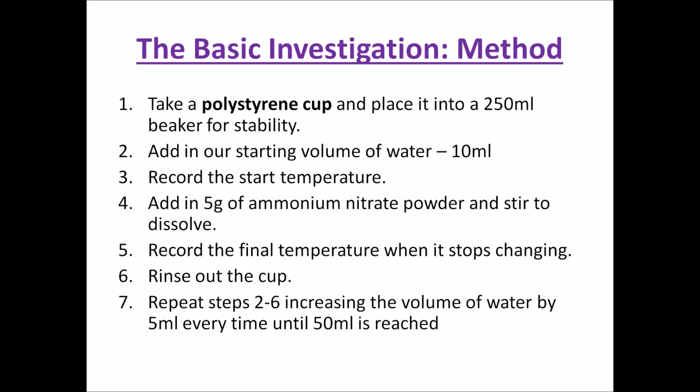So here's my basic investigation method. Take a polystyrene cup and place it into a 250 millilitre beaker for stability. Now, why do you think we might be using a polystyrene cup? We're using energy changes. Think about why sometimes in, for example, parents' evenings, they often get polystyrene cups of coffee. Why do we give polystyrene cups and not, say, for example, a metal cup for coffee? Then into that polystyrene cup we're going to add our starting volume of water, and you can see here I have given the volume of water, 10 millilitres. Record the start temperature. I don't need to say with a thermometer because that should be fairly obvious.